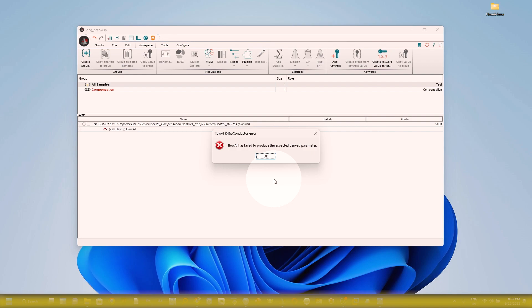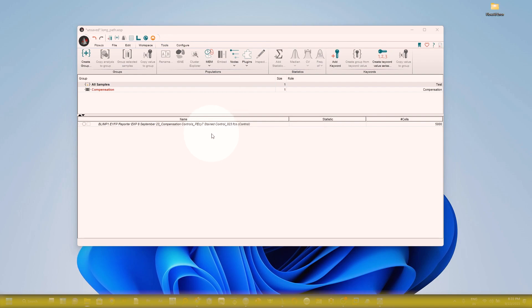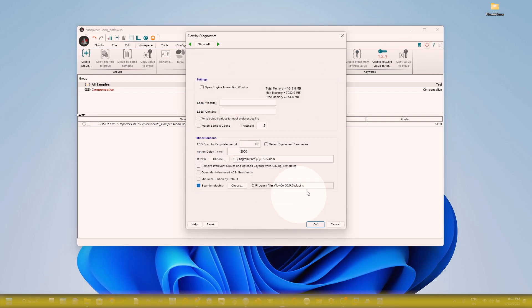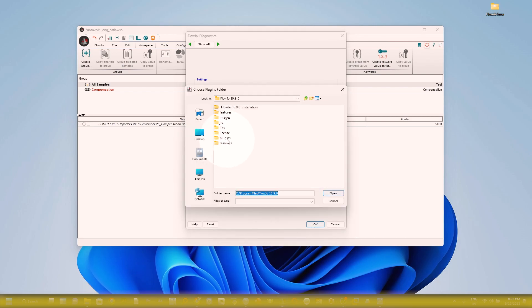Before going for any check, you have to confirm by going to the Preferences button. Click on Diagnostics — you have to check that your R path is assigned in the Diagnostics window. In my case, R path is already assigned.